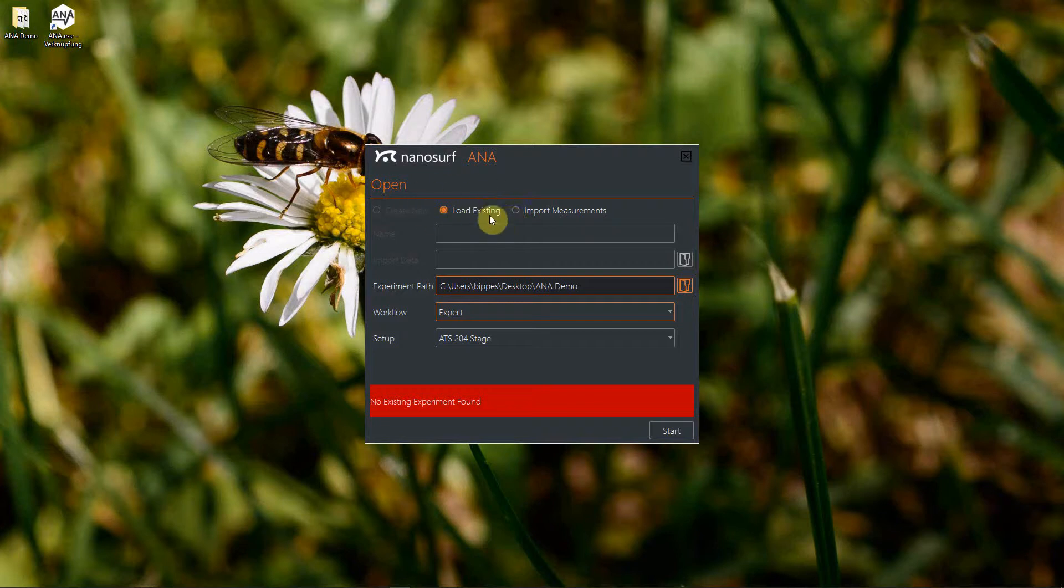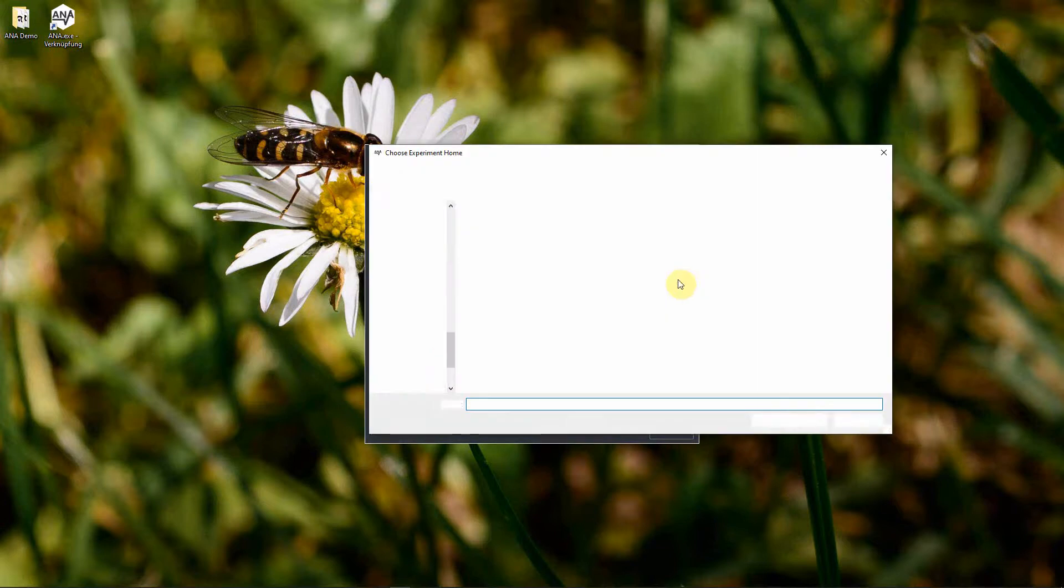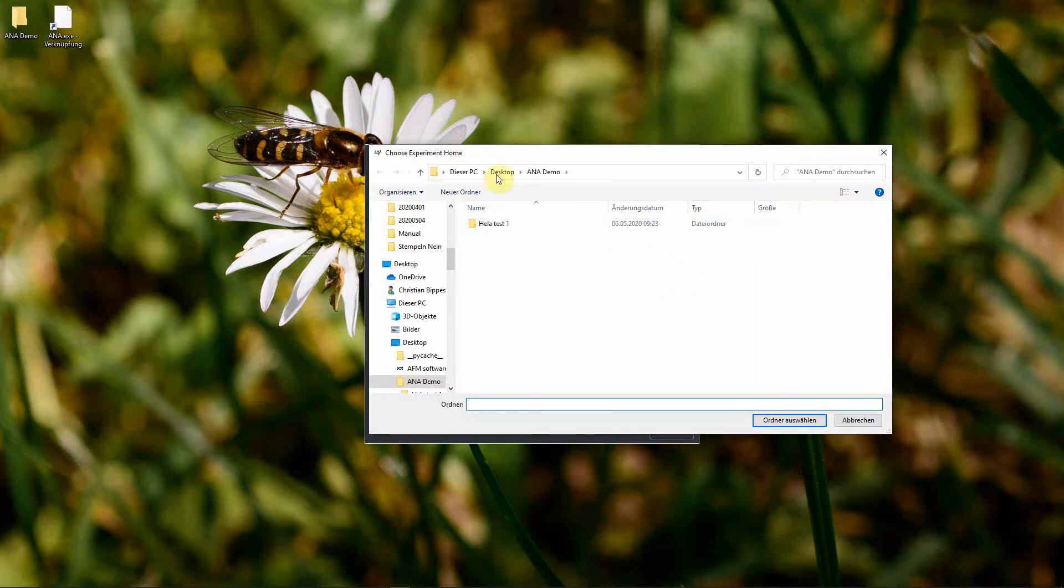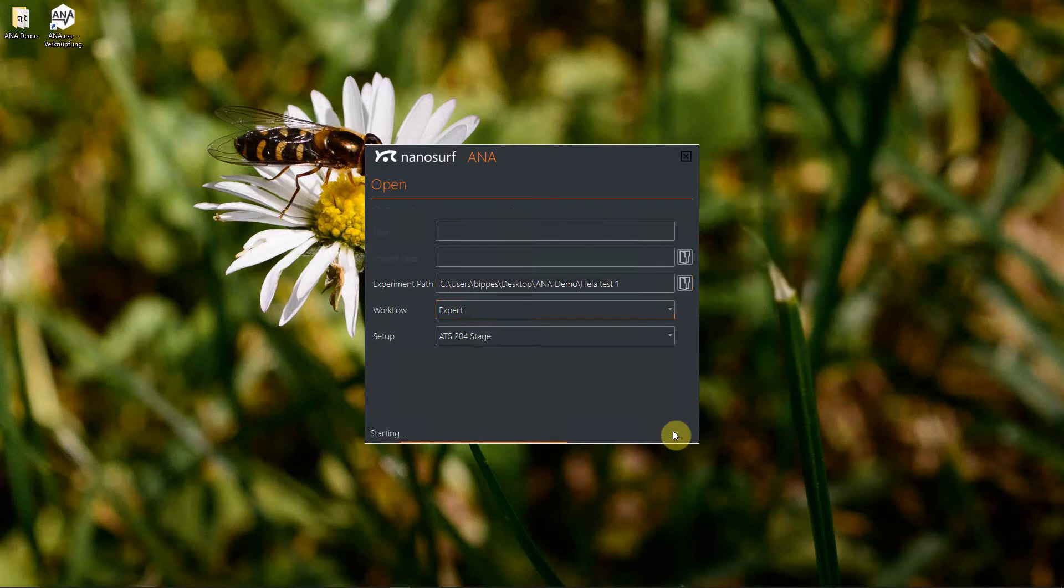In the second step, we have to locate where this dataset has been saved. That could be either on the PC where you recorded it in the folder you specified at that time, or when you copied it to another PC in the respective folder. For me, it is somewhere on desktop in a folder called HeLa test one. You select this folder and then simply press start.